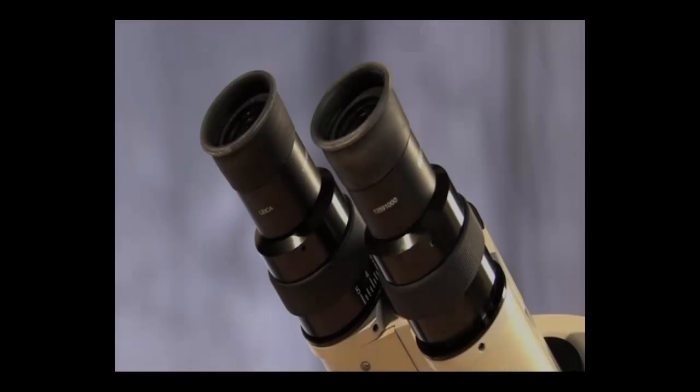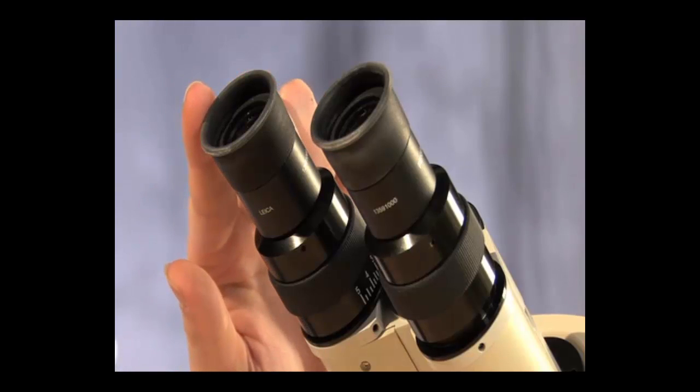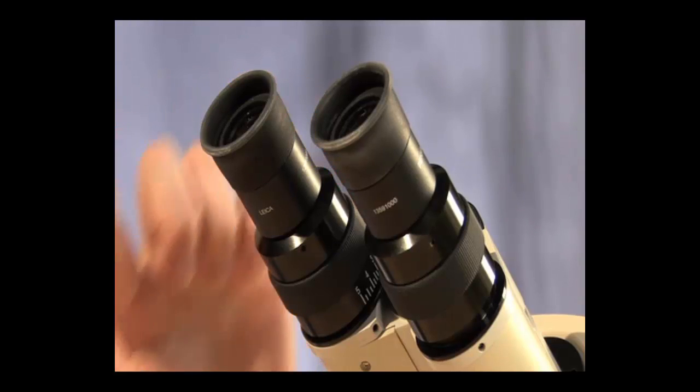So let's start at the top and work our way down. At the top of the microscope are the ocular lenses or eyepieces. These are able to magnify an image ten times.